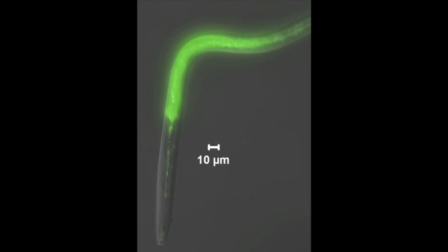This is a nematode after being exposed to insect hemolymph. As you can see in the pharynx, there are actually bacteria within it. Again, the bacteria have been labeled with green fluorescent protein, and we can view them and photograph them inside living nematodes.